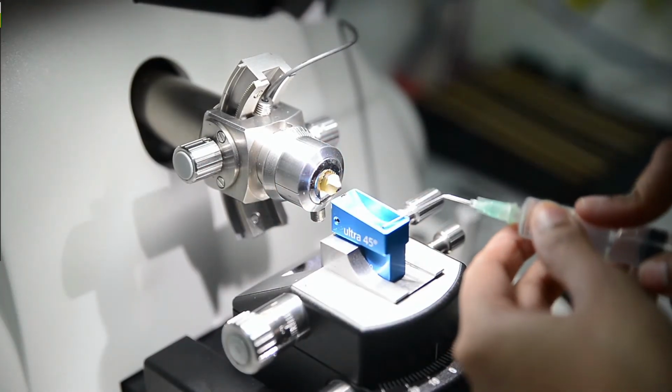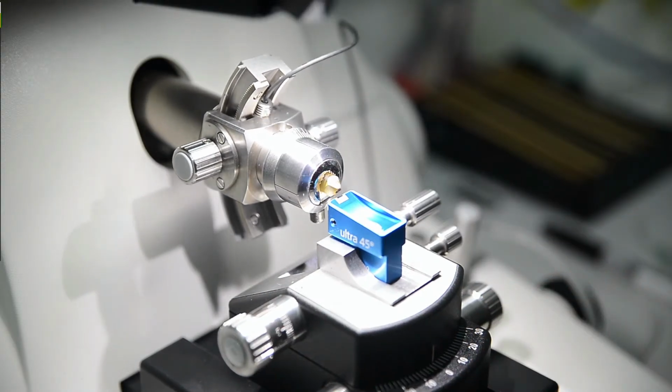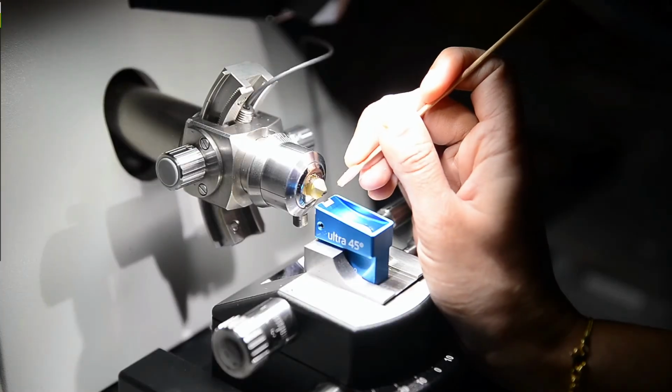We fill milli-Q water into the diamond knife and we proceed to cut the section. We should get the perfect ribbon section. Once we get the perfect ribbon section, it will be easy for us to separate the sections, either 2 or 3 sections.